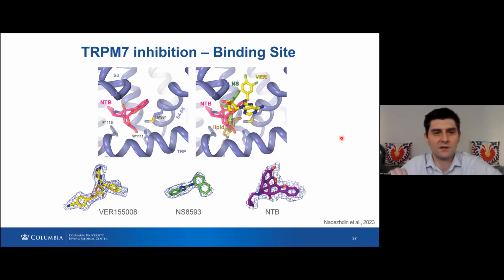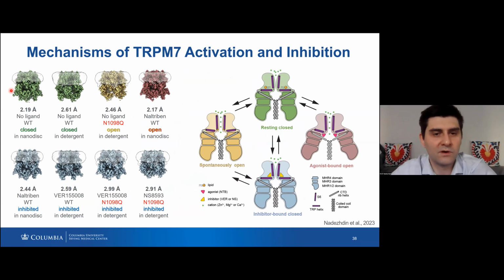And this is the full list of structures that we have from this project, and I want you to pay attention to these two structures. Why? Because again, there was the problem of justifying that when we add ligand, it actually binds to its specific site. As our apo state and ligand-bound state are the same, we have to have more proof that the ligand binds to its specific site.